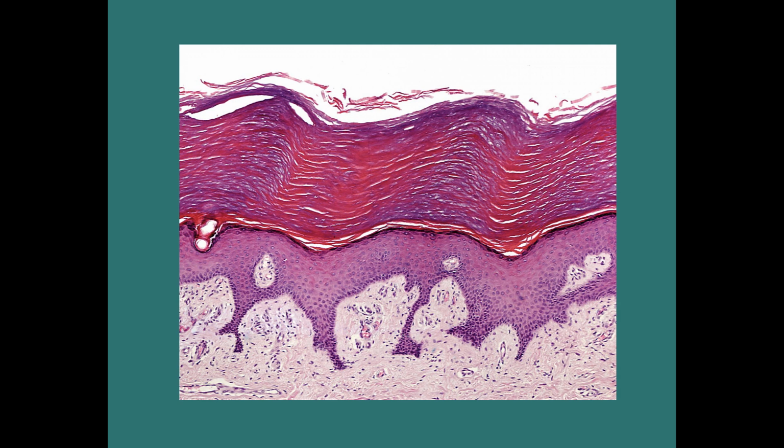When we talk about this slide here, we can see that our basement membrane is down here. We have these nuclei, and this entire layer is actually our multi-layered epithelial tissue. From this black line all the way to the top where we see just white, this is again indicating that there's either the external environment or a lumen or some kind of cavity. But we see that these cells up here are actually dead. We don't see any nuclei in these cells up on top.